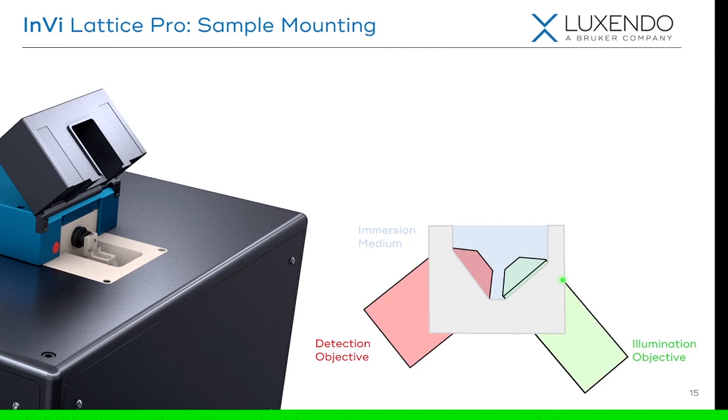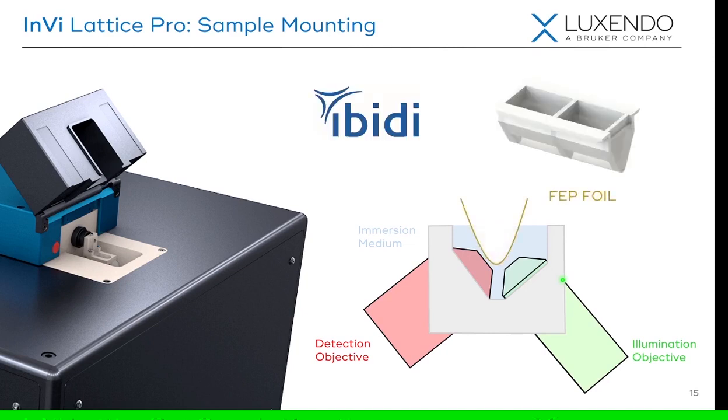So how we get them in is we've developed a chamber with a bottom that has an FEP foil bottom. FEP is just the acronym for Teflon, and Teflon has a very similar refractive index as water. So we line the bottom of this with FEP. We can immerse that into this chamber, and now that creates a physical barrier between the water immersion, which we're using for our illumination objectives, and gives us a small volume of our immersion media for our specimen.